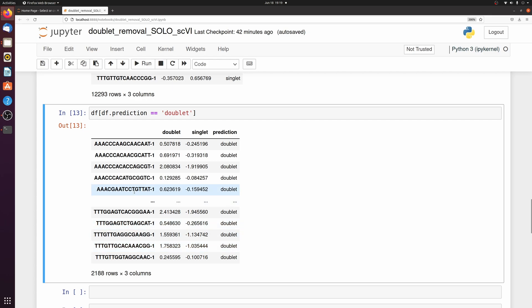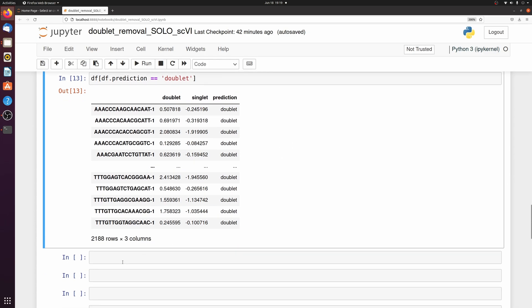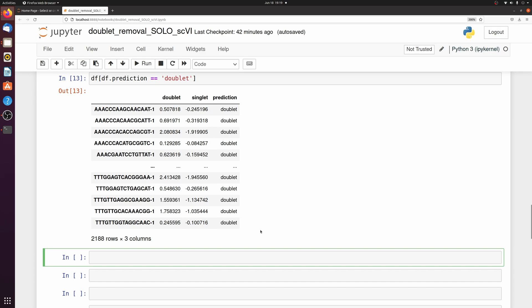So I just want to visualize this on a UMAP real fast. You don't need to do this if you're just doing this as a pre-processing step, but I just wanted to show what the results look like.